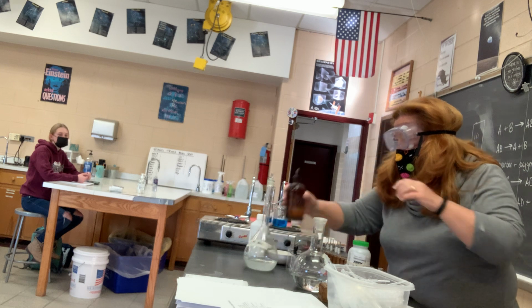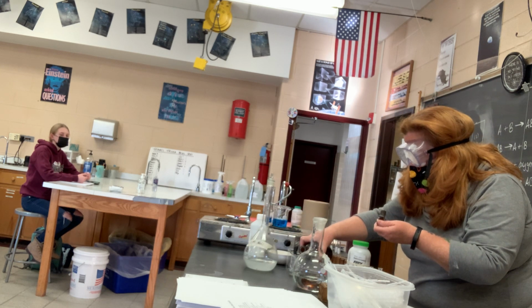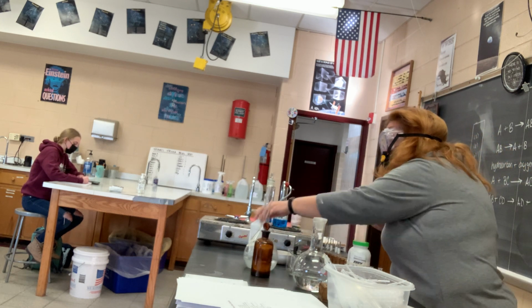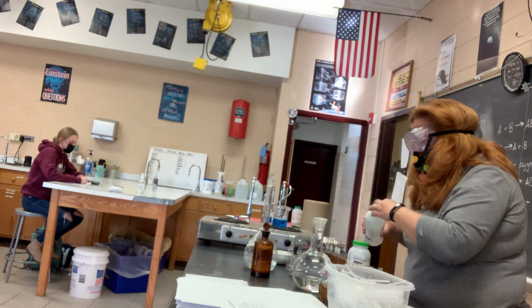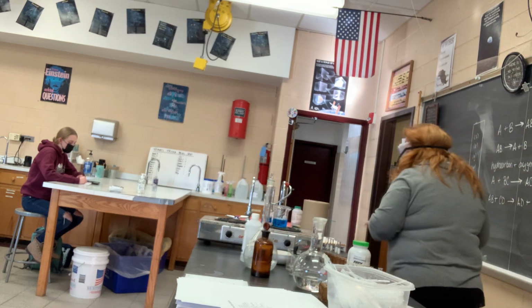Let that go a little bit longer. So the silver nitrate is a clear liquid. Salt water, clear liquid, unless it's Beckley water, in which case brown stuff comes out of it, but that's okay. So those are the reactants.